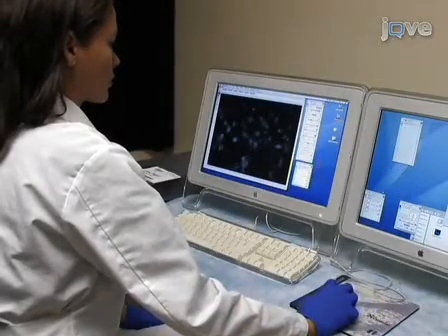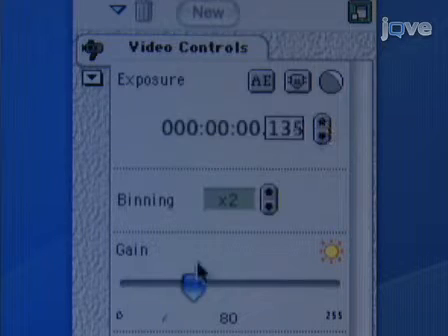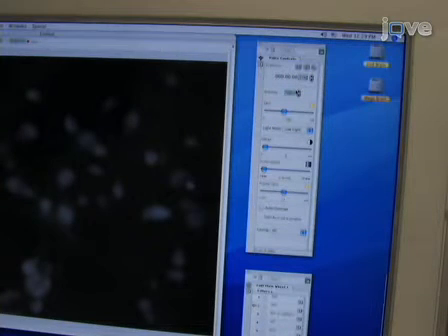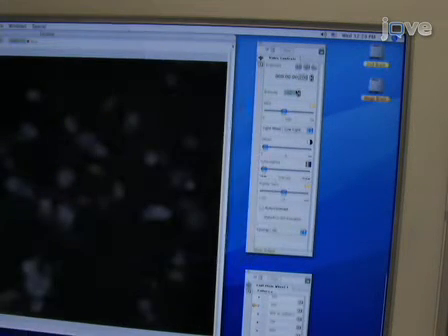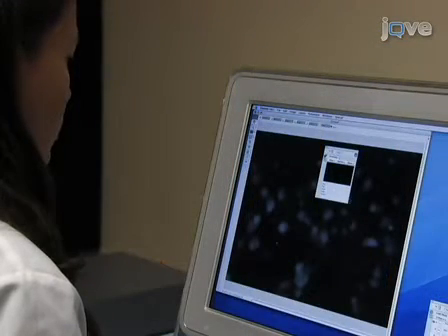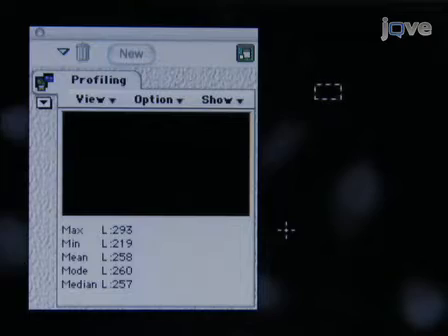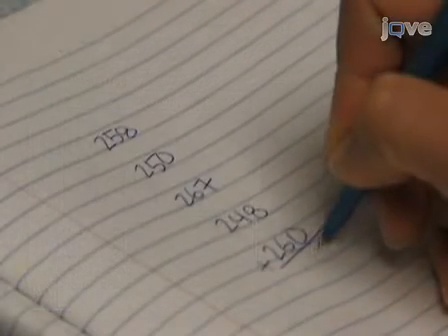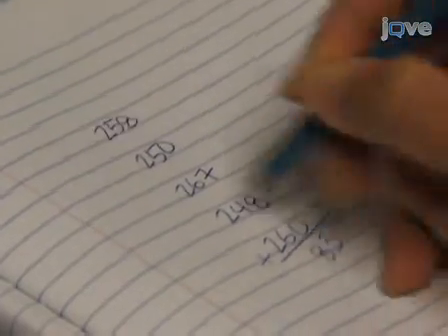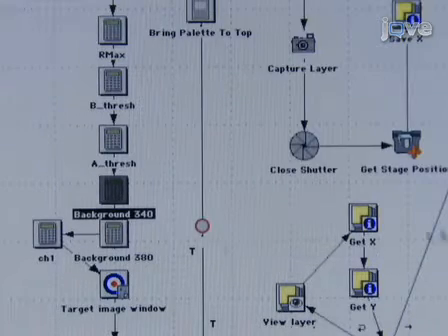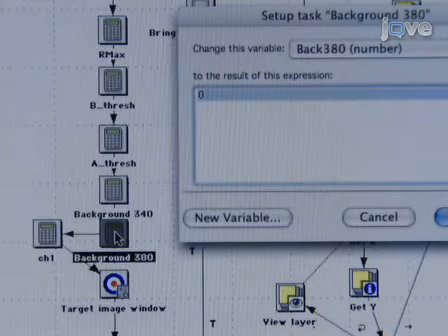Examine the cells using the camera and set the gain and exposure to generate an image that is close to saturation when illuminated at 380 nanometers and below saturation when illuminated at 340 nanometers. Keep the exposure time at 200 milliseconds or shorter if possible. Once set, do not change the camera gain or exposure. Collect an image at each wavelength and use the region of interest (ROI) tool to measure the background intensity at a variety of locations for each wavelength. Calculate the average of the background values and enter them into the imaging program; background intensity will be subtracted from each pixel in the field.